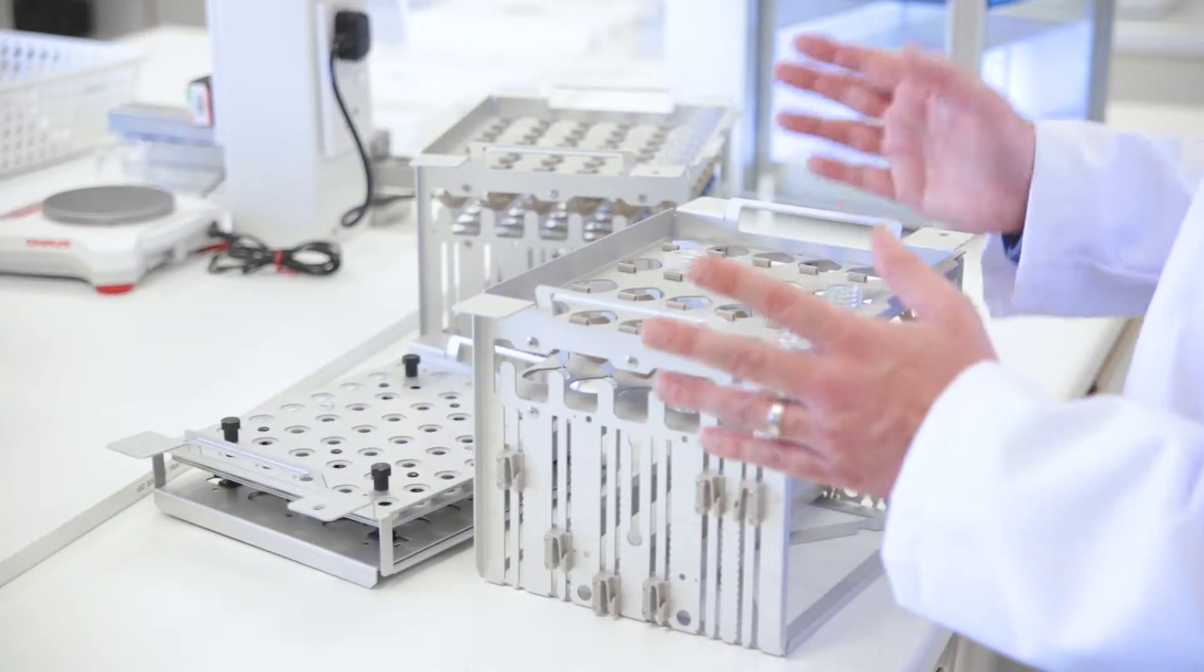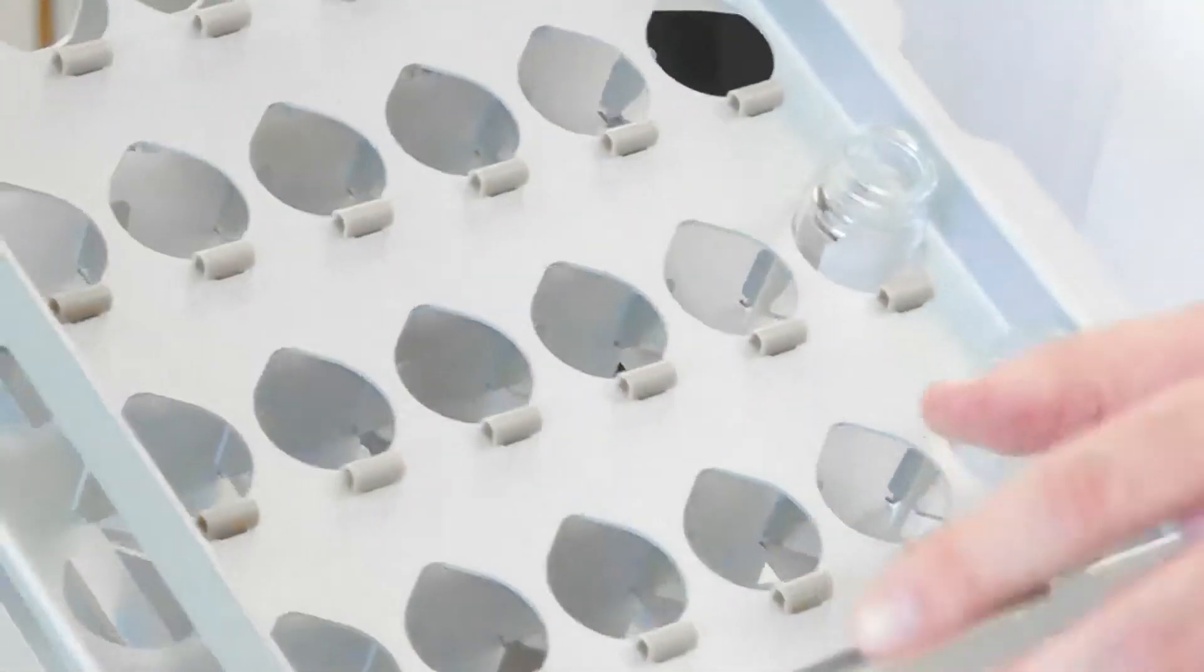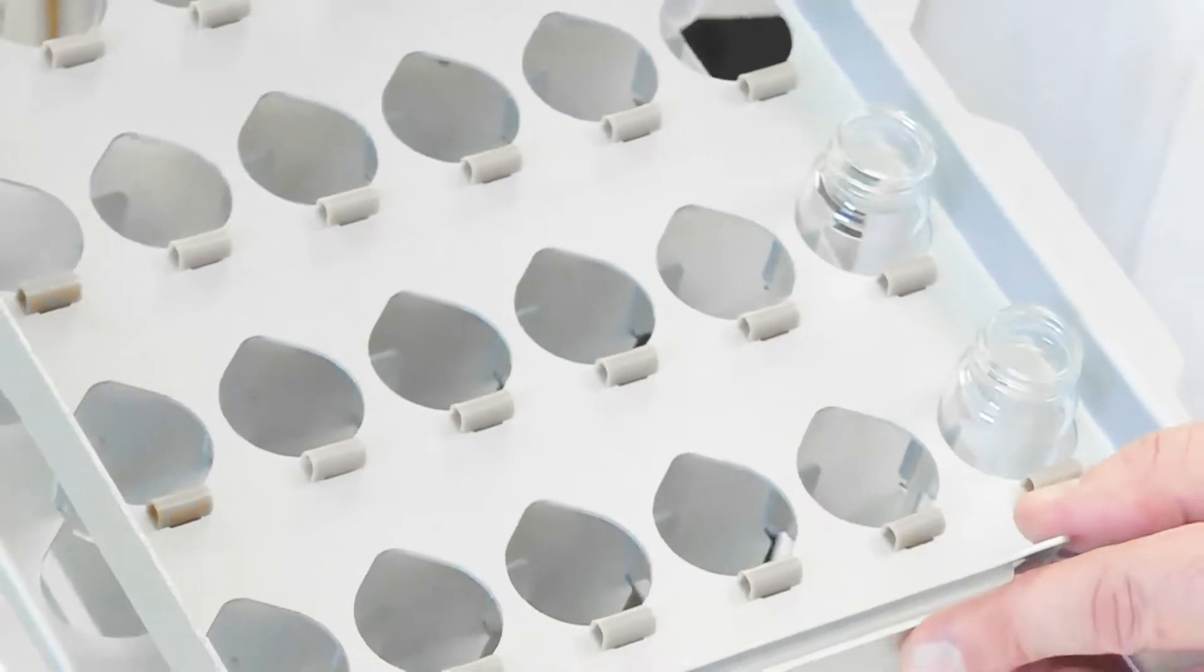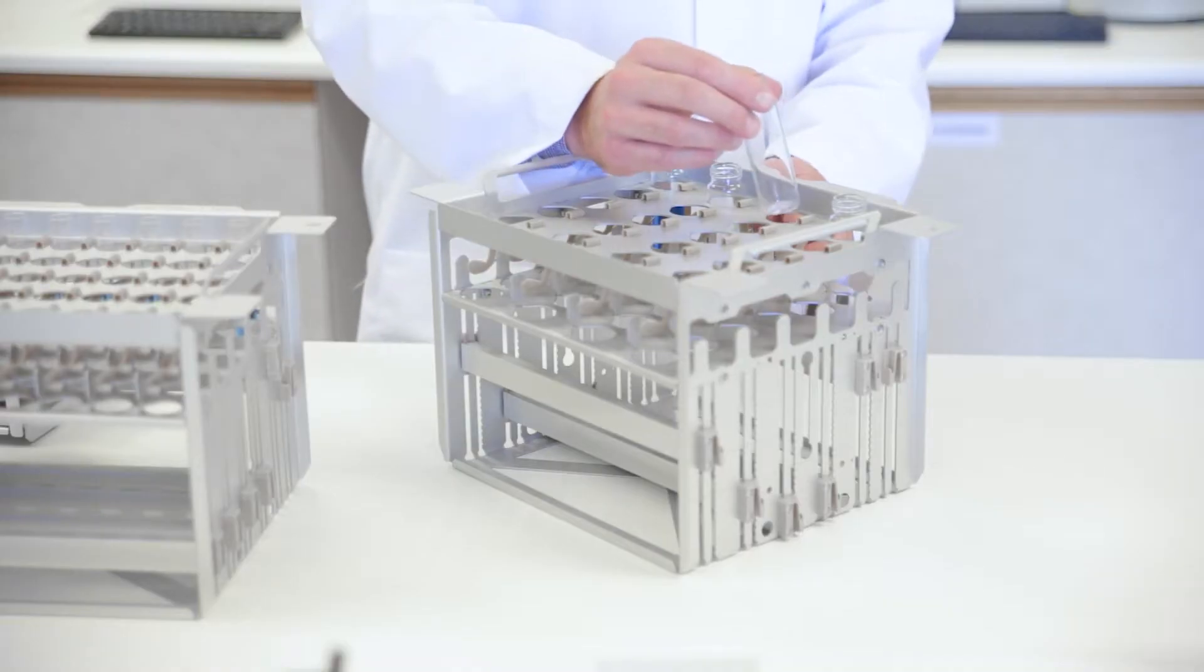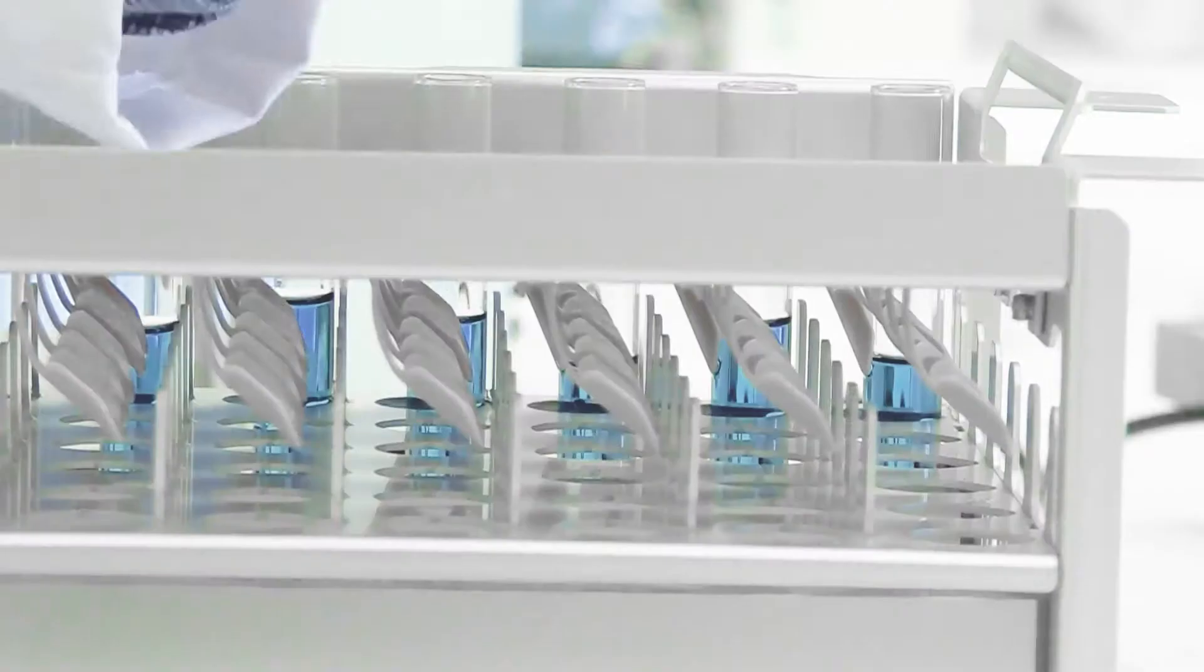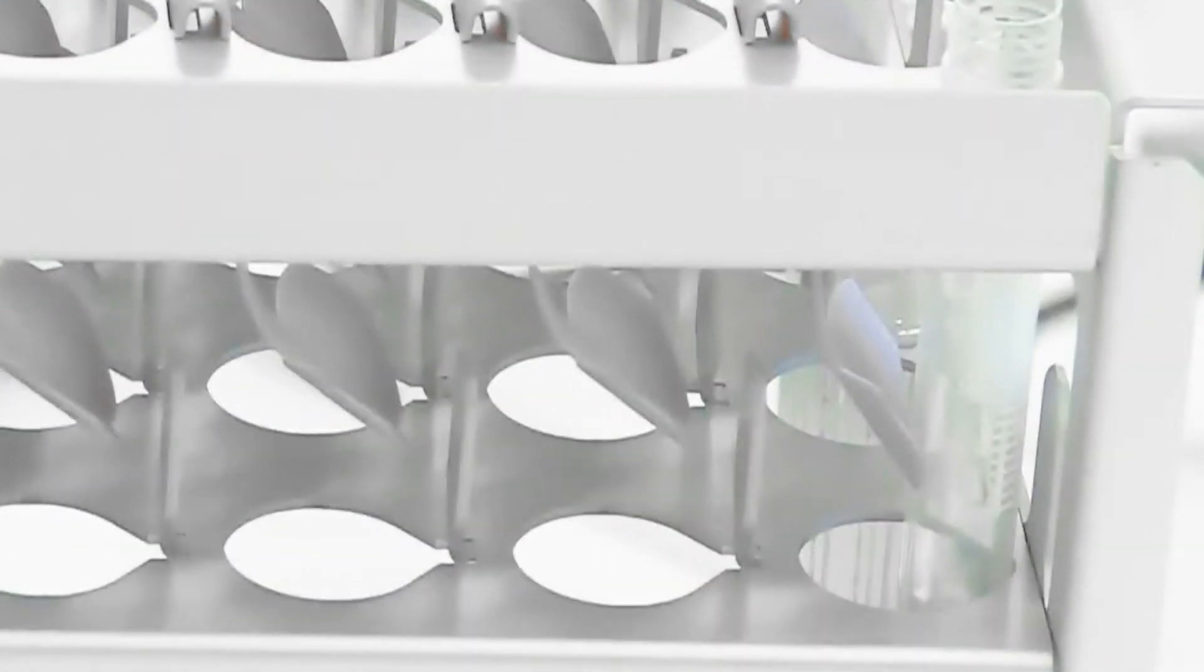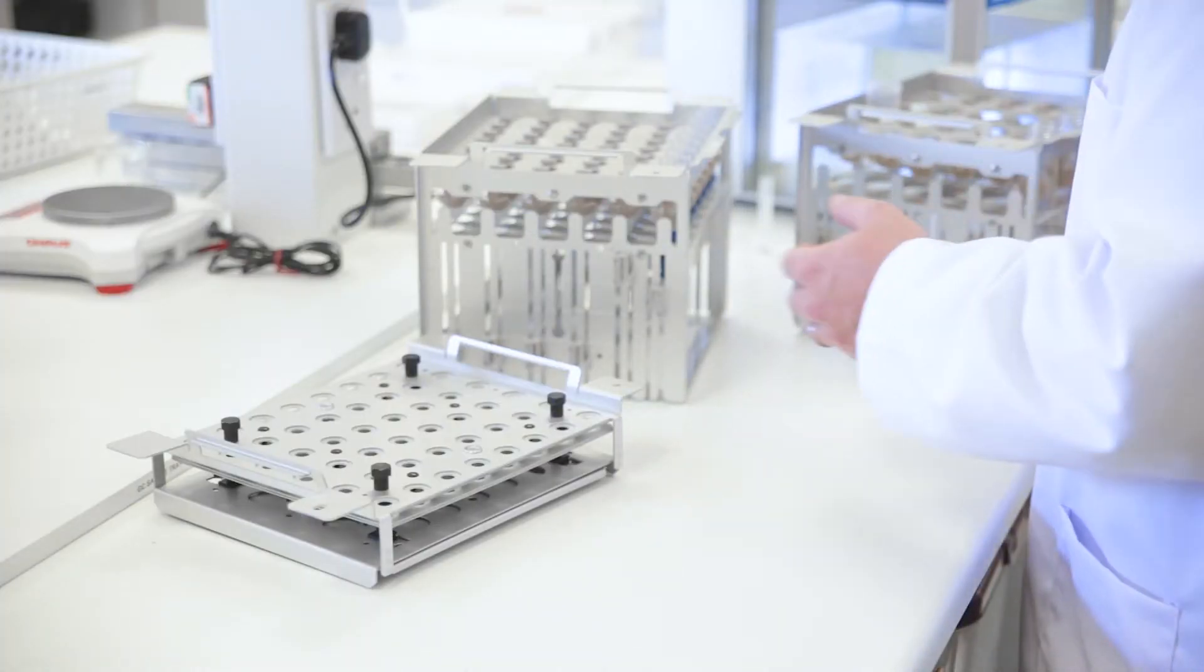You might be thinking how we're dealing with the different outer diameters of these vials. We've got this spring clip on this rack, so depending on the outer diameter of the vial, it's always ensuring that your vial is towards the right-hand side of this rack. Here you can see the spring clip in action ensuring that this vial is pushed to the right-hand side of the rack.